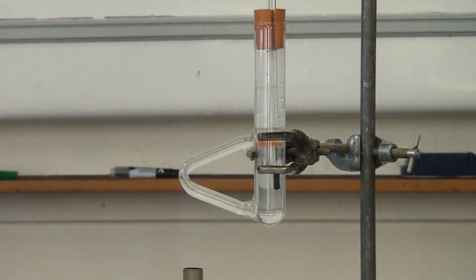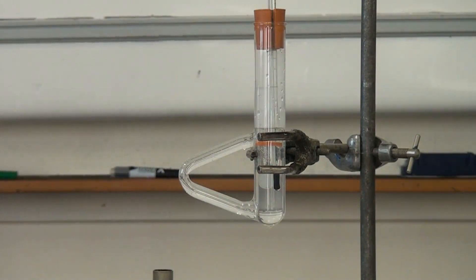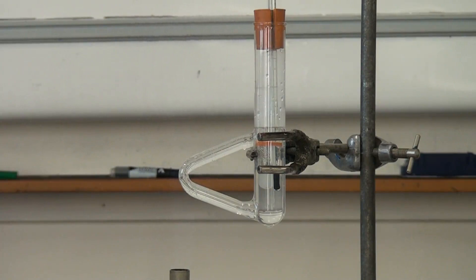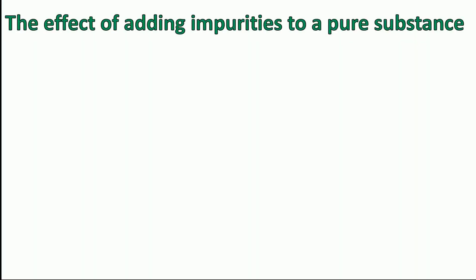We can see it's just beginning to melt now. Most of it has melted but there's still a little bit of solid in there, so I'm moving the Bunsen burner in and out of the side arm to keep the heating really gentle. Now it's completely melted, so at this point I'll read off the melting point from the thermometer.